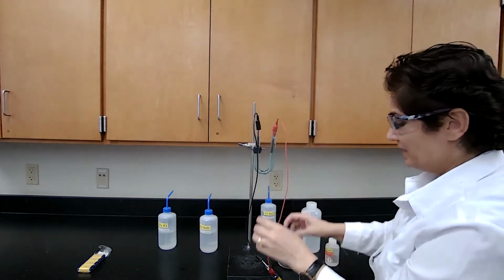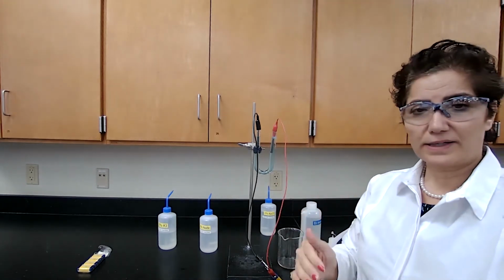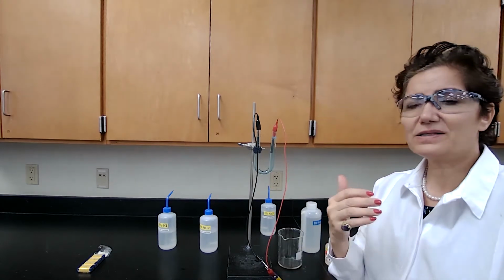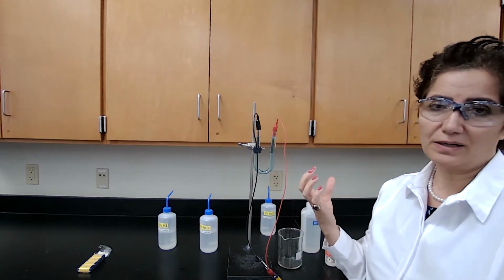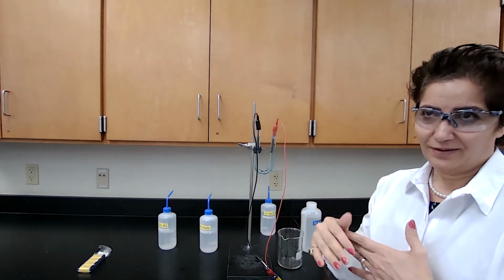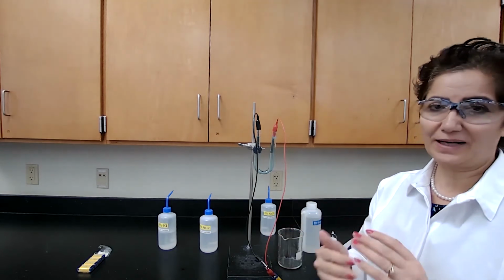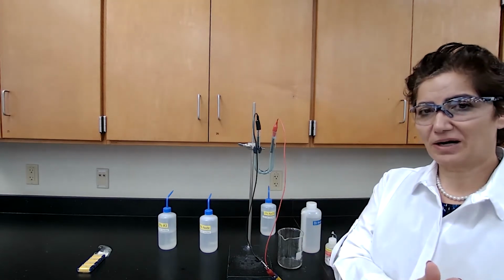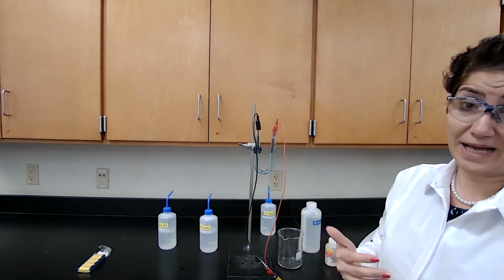Now, similar to what we had before, water is going to either oxidize or reduce. If it does reduce, we get the hydroxide ion, and the phenolphthalein would change color. If there is no change in color of phenolphthalein, then water is being oxidized. Water is being either oxidized or reduced, so if it's not reduced, then we can choose that for the anode reaction.